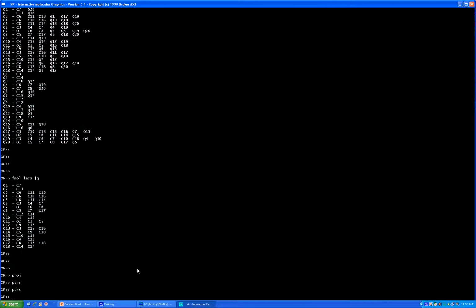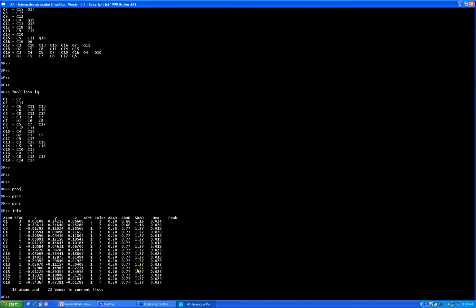Okay, let's escape from that, and let's do info to see if anything happens with the atoms, and it looks like no, they stay intact. No funny thermal parameters, so you're fine. So the next thing you want to find is your hydrogens. Well, how do you do that?